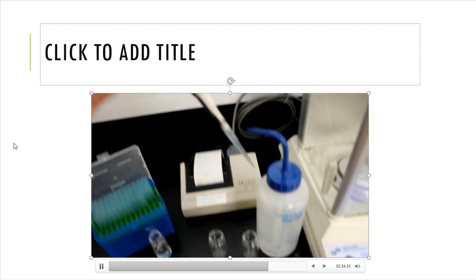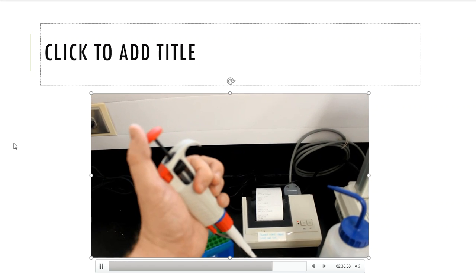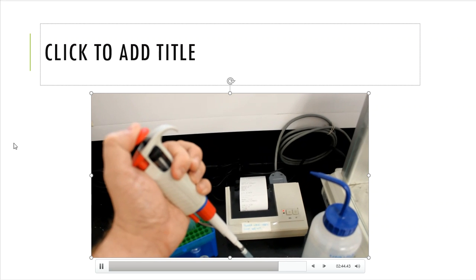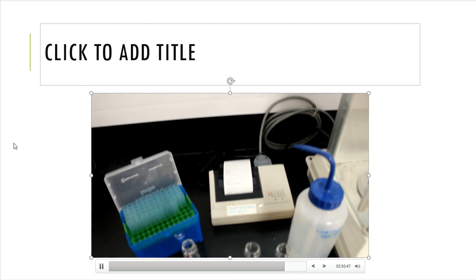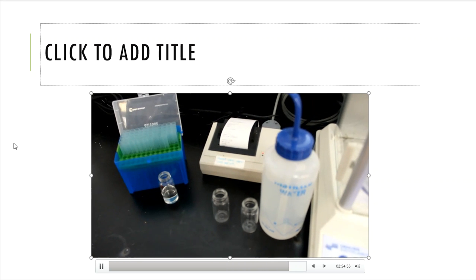And then to deliver the sample, I'll go to my container, and up here at the very top, I'll just push the plunger down to the first stopping point, and then there's an extra piece that you just push down even further. That will send a little poof of air, so that the remnants of the sample are pushed out of the micropipette tip.